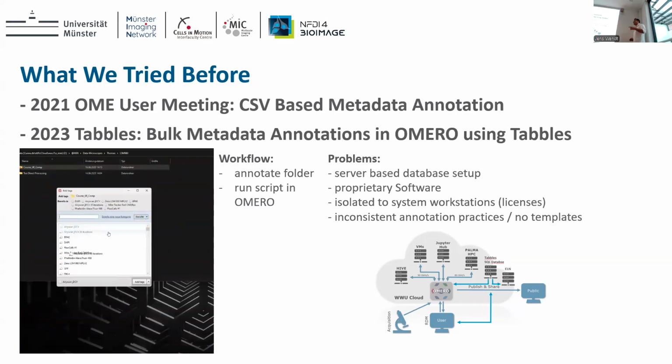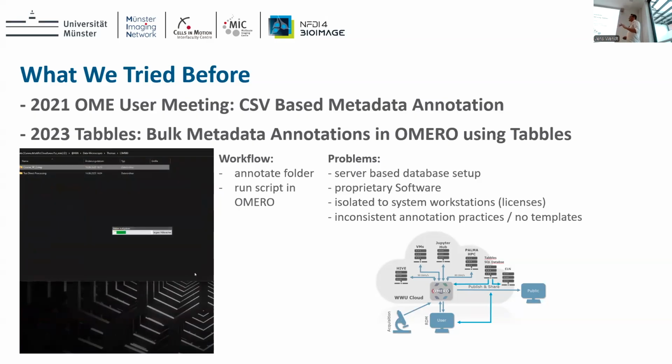However, the problem is that due to licenses, it's proprietary software, we only have it on the microscope computers. You need the database to set this up, and users then have to go to Omero and run a script to get the metadata out of the SQL database, basically. However, it was quite fast, and I have used it for 2, 3 years now on my computer at home for all my files. It's quite good, but not something all users are doing because we do not have the license for them to do it on their own computers. Otherwise, we need 1,000 licenses because you need it for every computer you're using. So this is basically a problem.